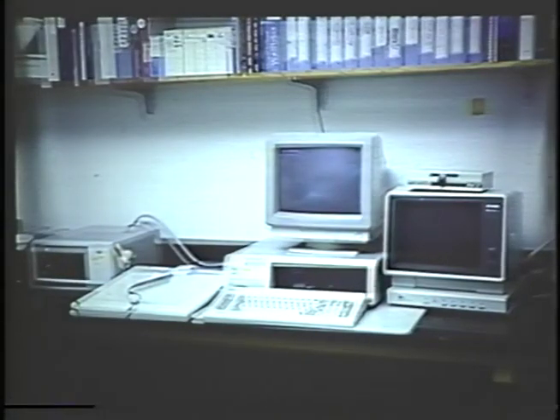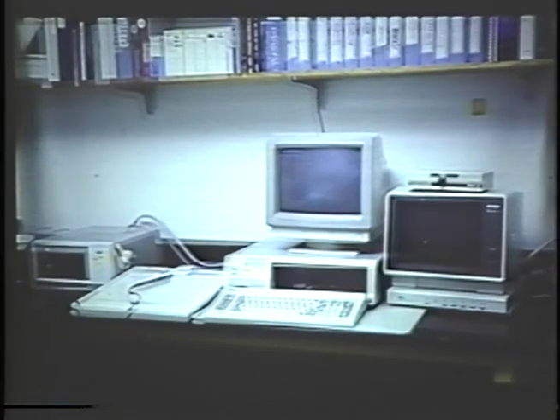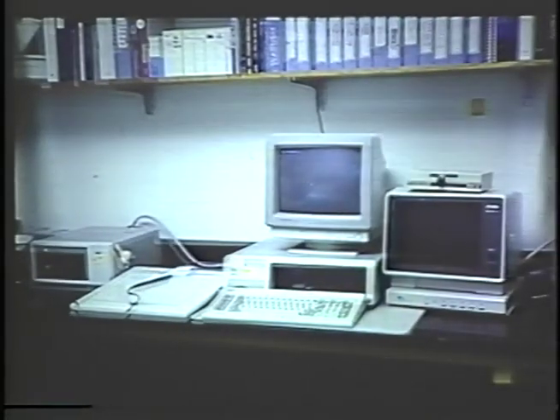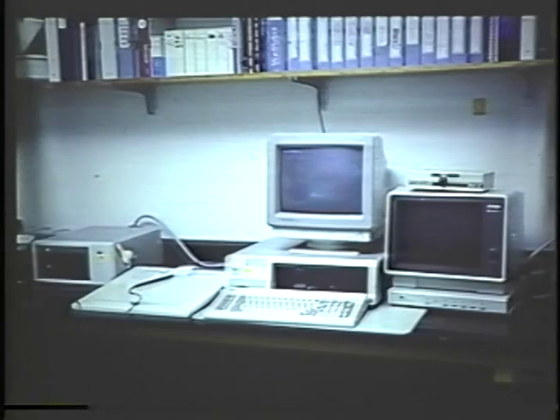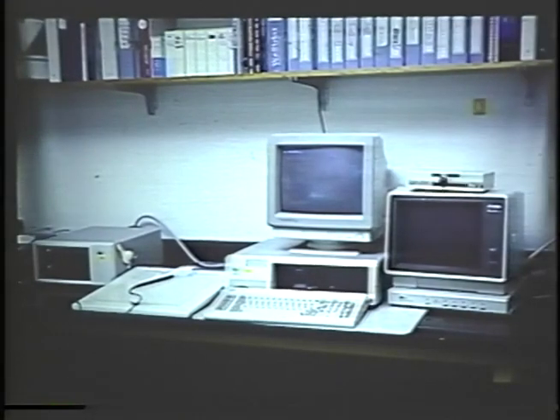The system that we use is based on an IBM PC. The current version uses a monochrome monitor for text, a color monitor for graphics, and a digitizing tablet for tracing contours off of micrographs. We are in the process of trying to update this so it can all be done on one monitor, and I hope that will be out within about 6 months.